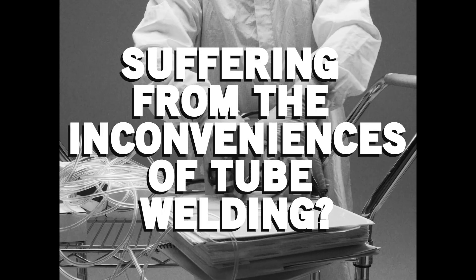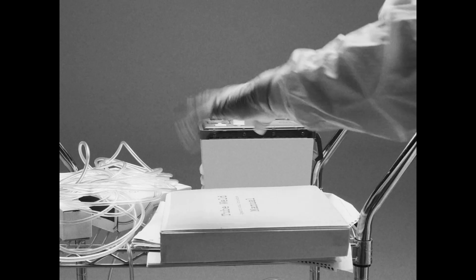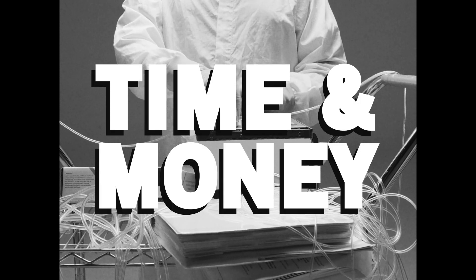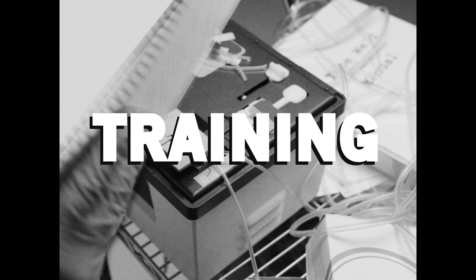Are you suffering from the inconveniences of tube welding? Tired of those bulky, annoying carts always getting in the way and taking up valuable space? Fed up with the time and money it takes to maintain your machine and train operators?